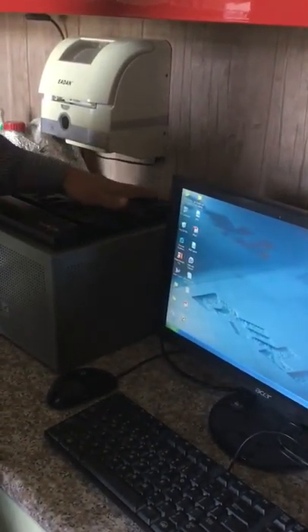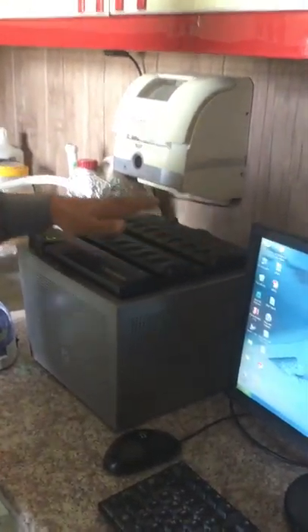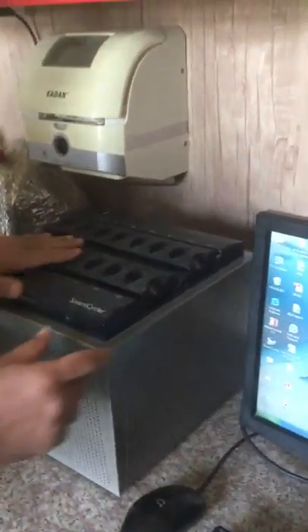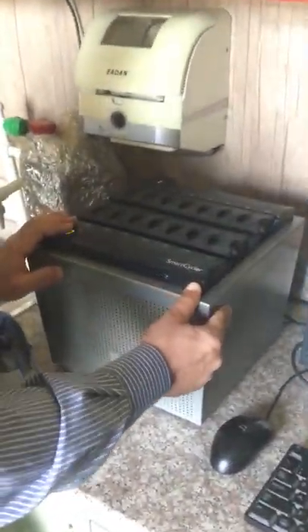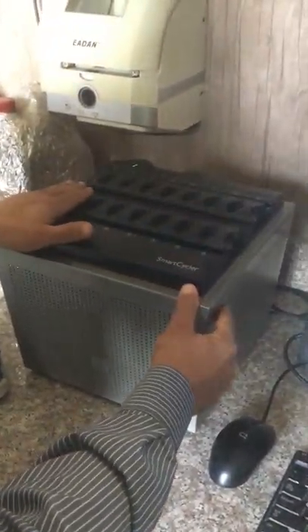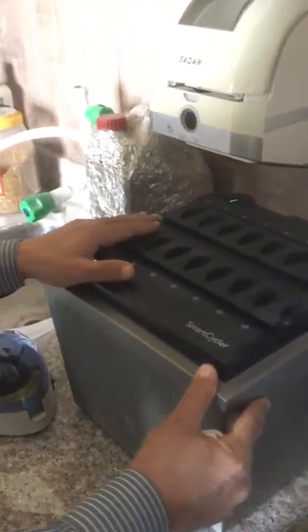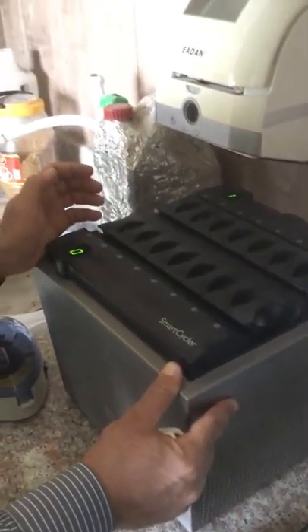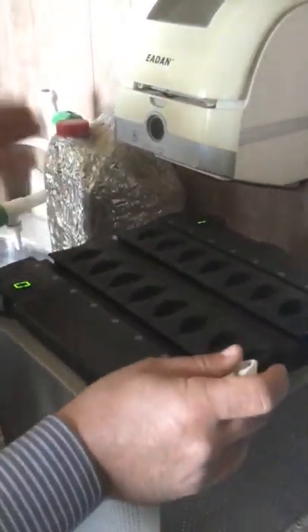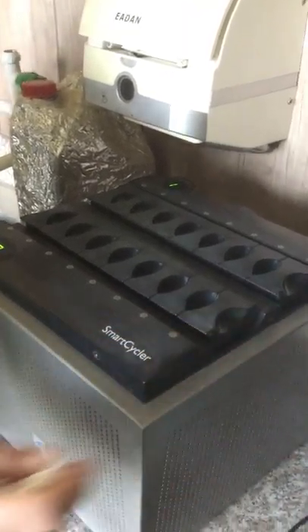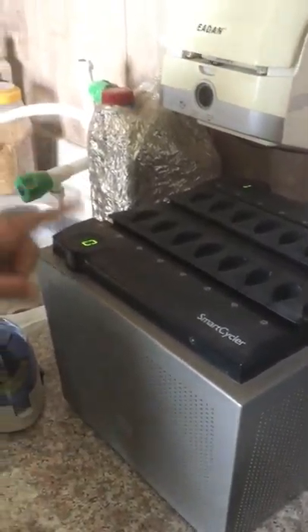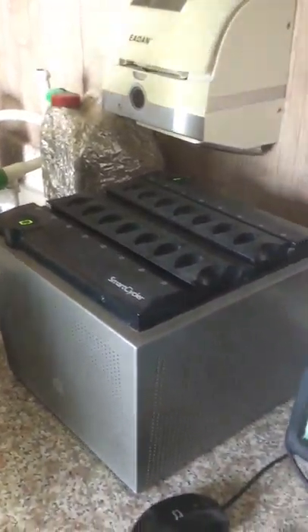First, we'll start the computer. After that, we'll connect and push power to start the block. The first block maybe reaches to about 96 wells of blocks. This is a block and will be binding with another block and another block, and each one has a certain name: A, B, C, D, etc.